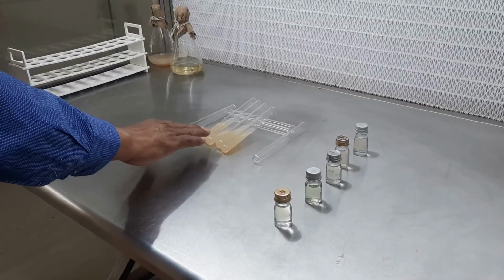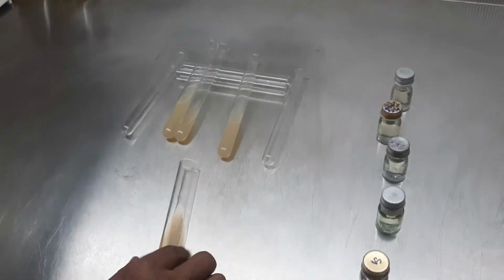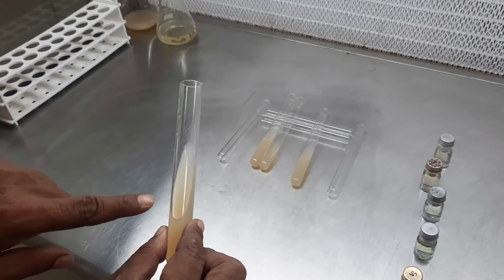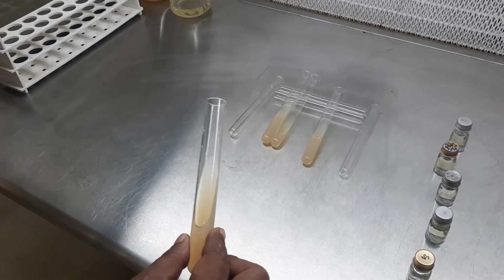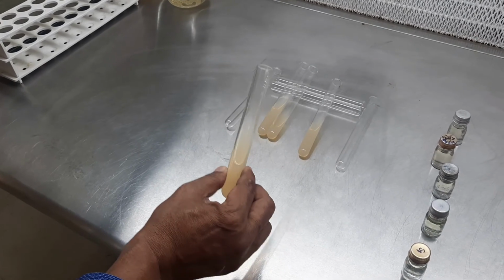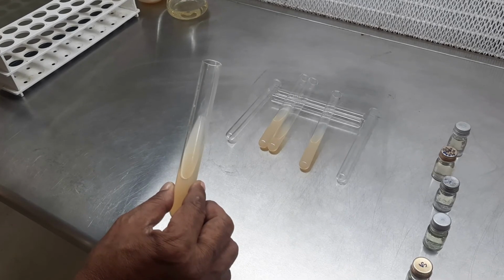Thank you. These are the slants and it is inclined. As you see, it is inclined, and bacteria can be grown on these inclined slants, and it is sterile because it is not interfered with by any other environmental bacteria.